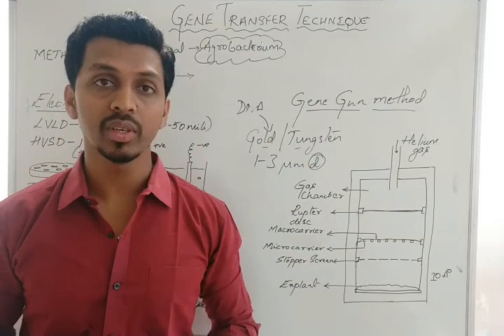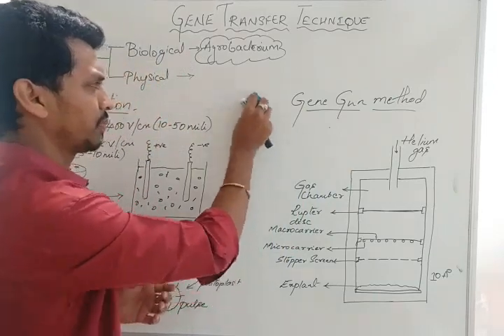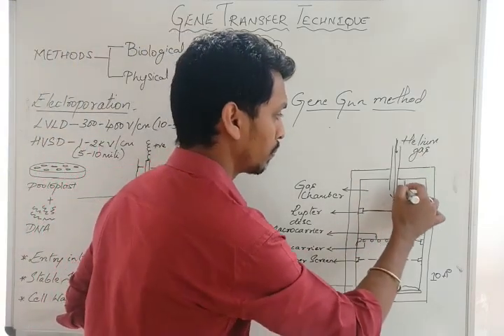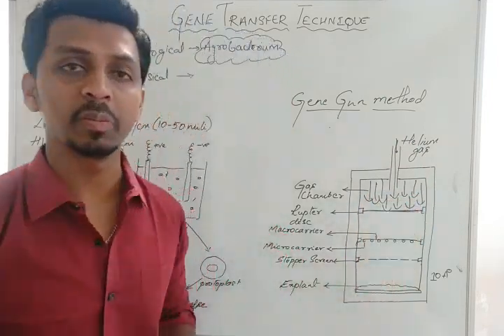Now let us go into the actual process. So I have helium gas here. Initially, we send helium gas into this chamber.